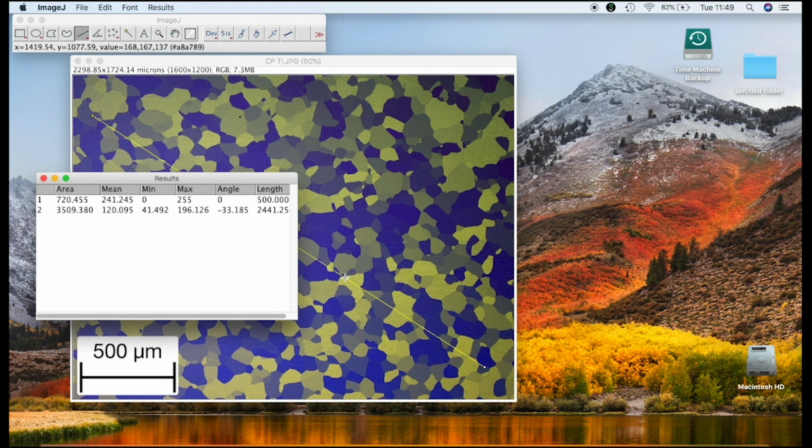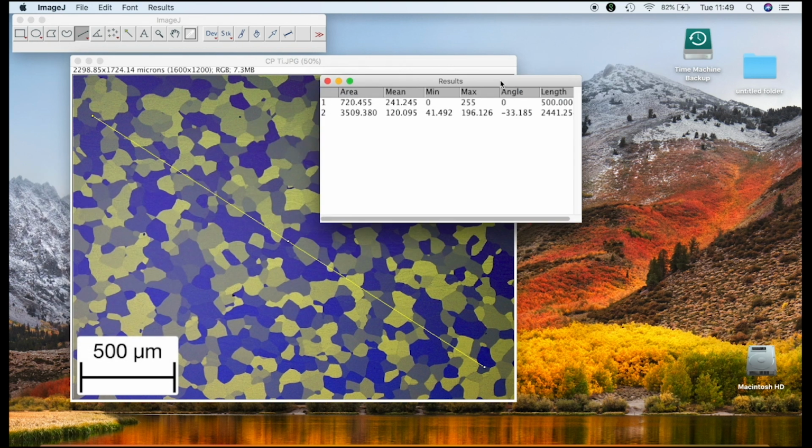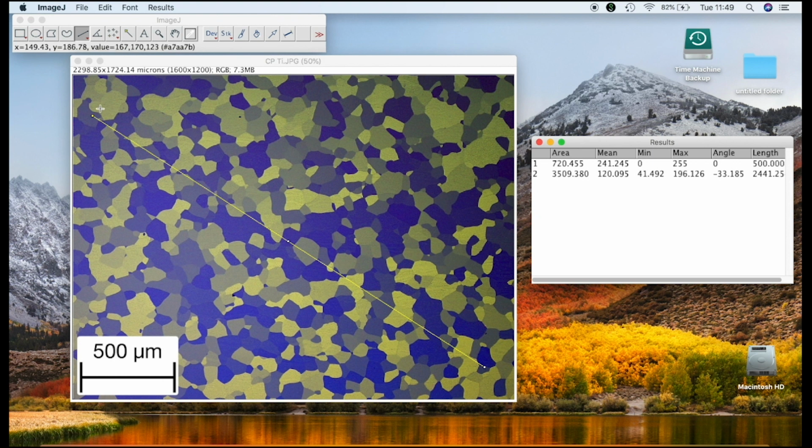Yeah, and if you don't know how to do that properly, you need to watch the first video, not the second, on the counting method of how to count these grains. And if you watch the second video, you'll see that I put up an Excel spreadsheet, which will give you some sort of order of counting. Now that's how you do it.